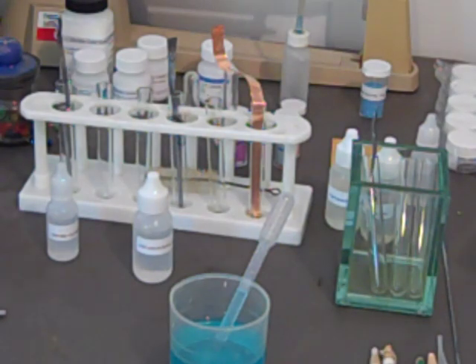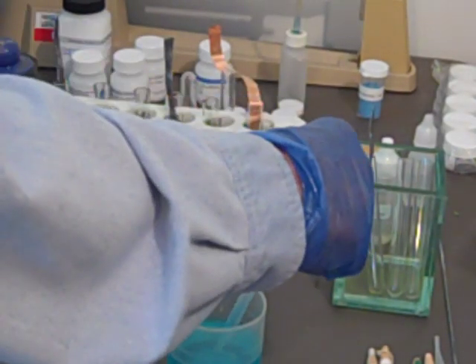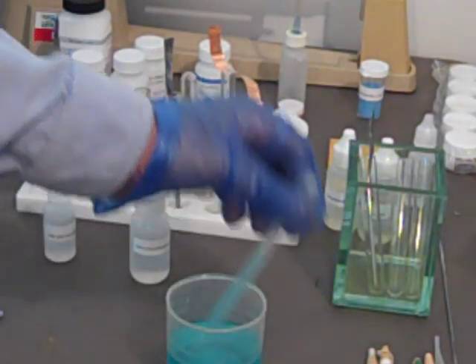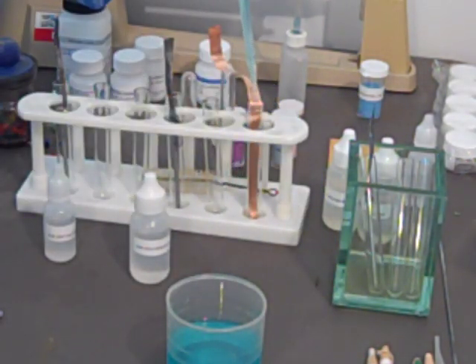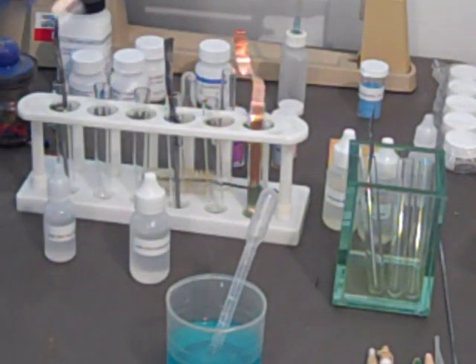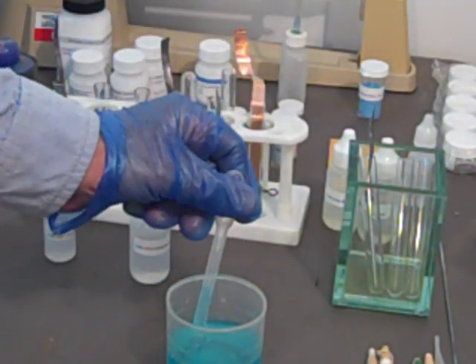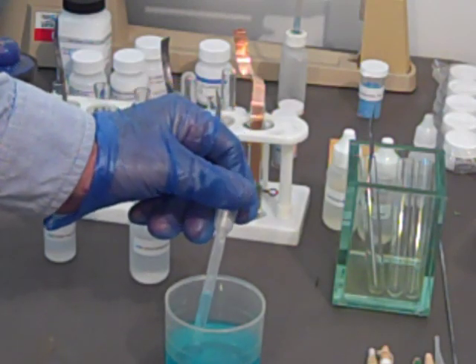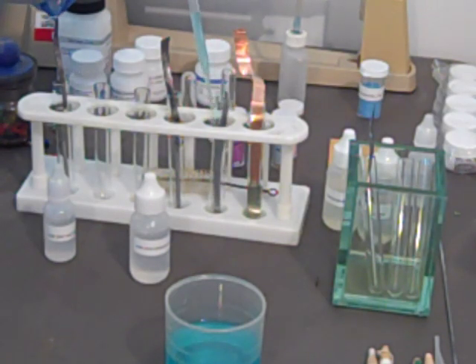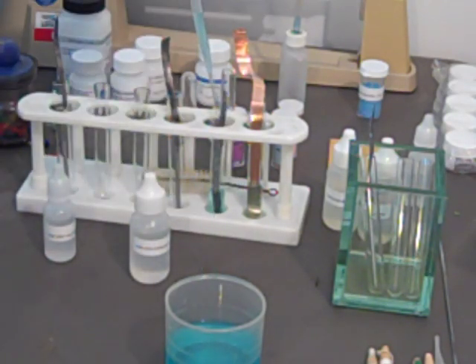Okay, this is the first time we're running through this experiment, and I hope I remember what to do here. It says to add 3 milliliters of copper sulfate to the first set of test tubes. There's one there for the copper sulfate. We haven't added the lead here yet to the second tube. Put the lead in so we can see it if it reacts. Make sure we have a full 3 milliliters. A little bit short there. We'll add a few more drops later. Whoops, right down the outside of the tube. We haven't done this yet. This is a first run.